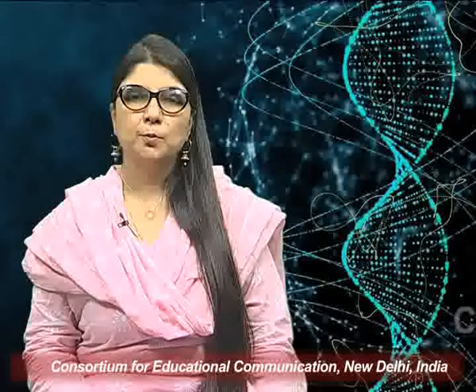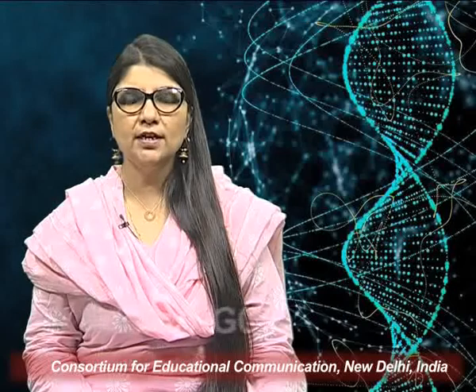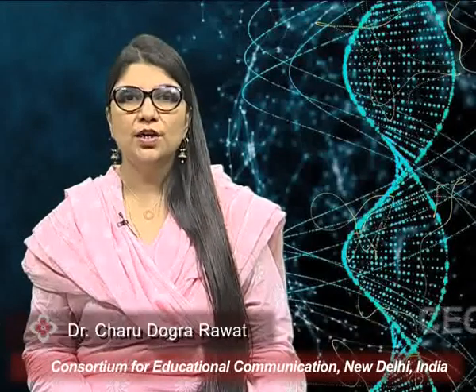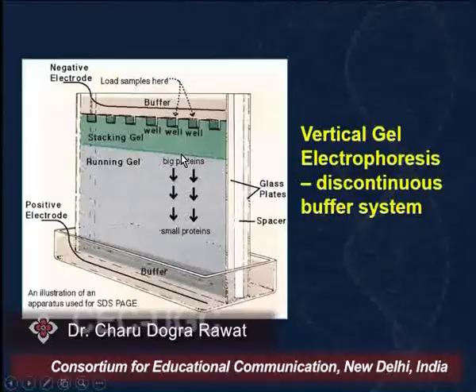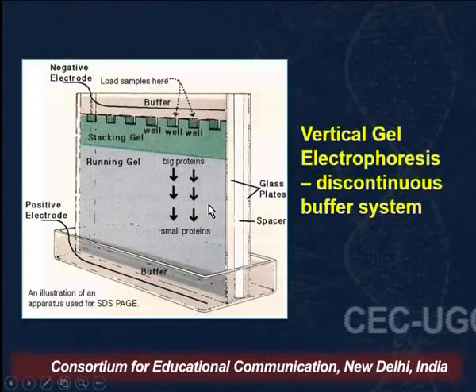Hello and welcome. So we discuss the SDS-PAGE gel system for Western blotting, and we talk about the vertical gel electrophoresis system. In the vertical gel electrophoresis system, there are two types of gels that are cast, the stacking gel and the resolving gel, for the optimal resolution of the proteins that have been loaded in the wells.